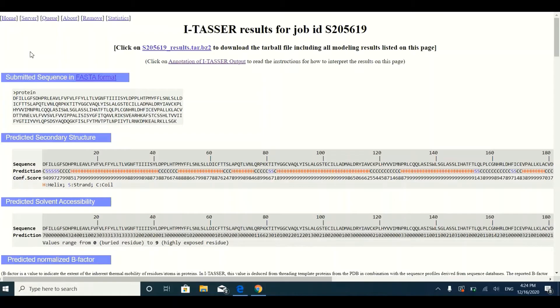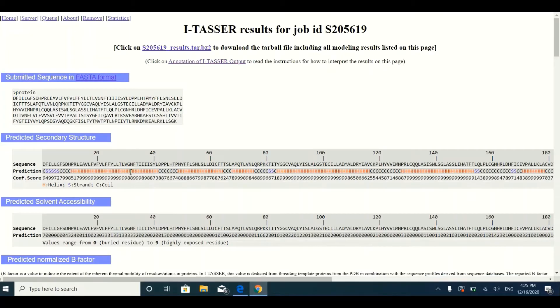The first thing you will note on the results page is your query protein sequence which you submitted to I-TASSER. The second thing is information about the secondary structure of your protein — you will get an idea of which part of your protein sequence is going to form an alpha helix, which part will form a beta sheet, and which part will form coils. The secondary structures are represented with alphabets.